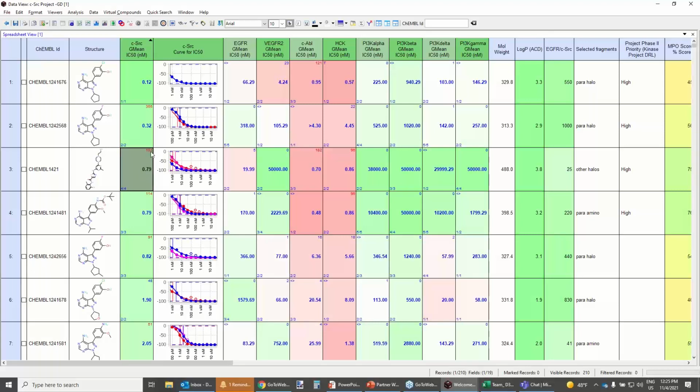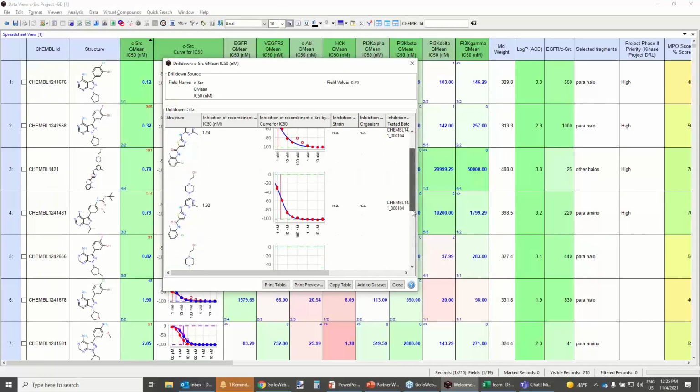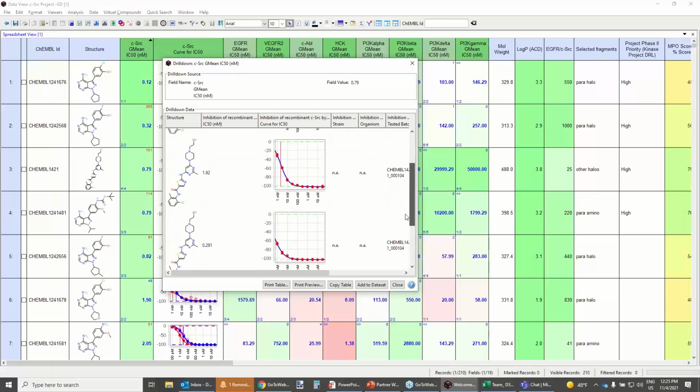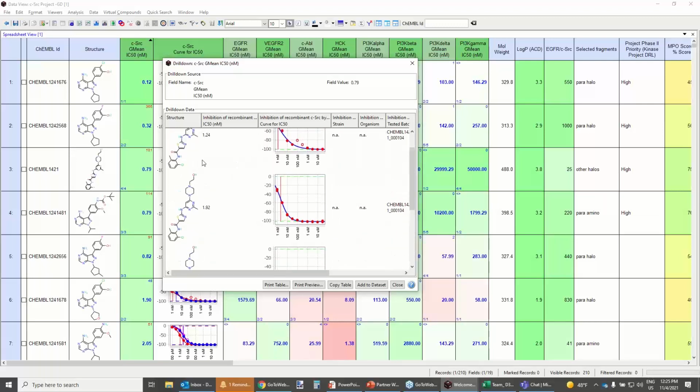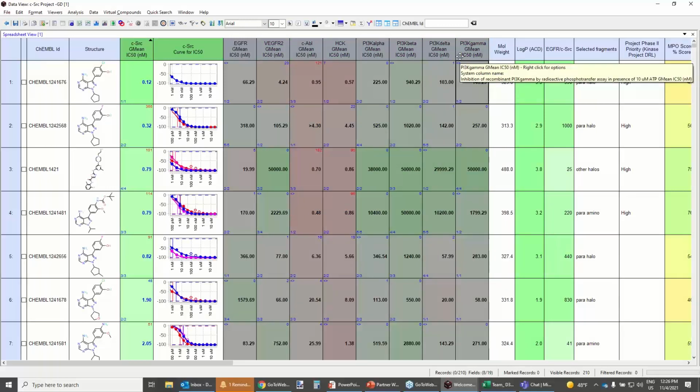And also, if you look at the top right of the cell, it gives a little number. In this case, it's in red, and that red value is saying, hey, there's a large spread of values under here, and you should be a little careful. Whenever you see that kind of thing, we can always double click on these data values to drill down, have a look at the individual values, and also in this case, the fitted dose response curves associated with these compounds. So now we can get a good view of not only the data values, but the quality of those data values.